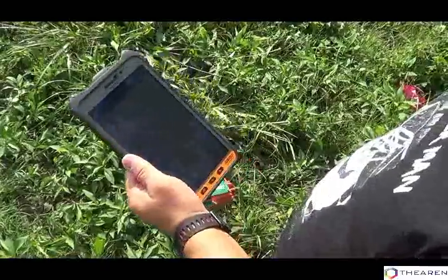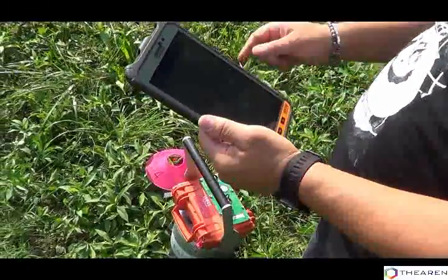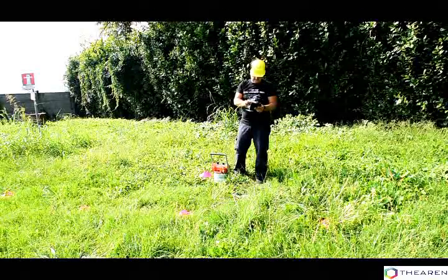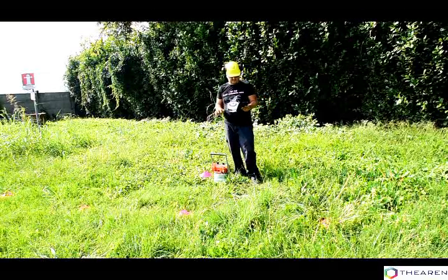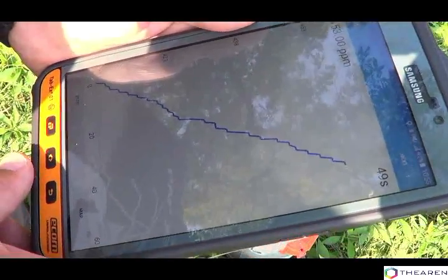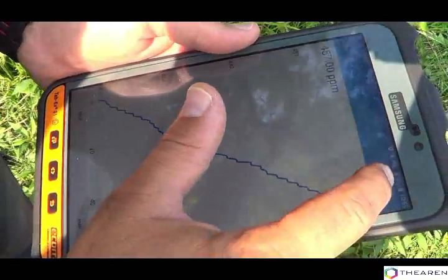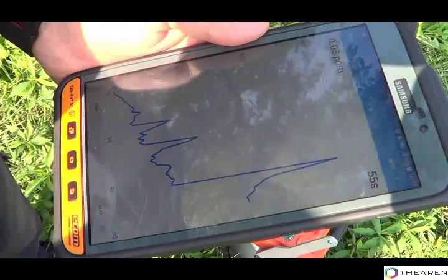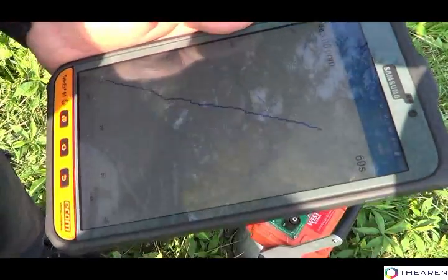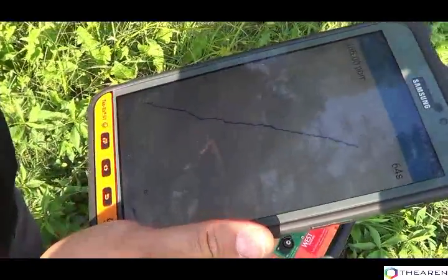A software connected by Bluetooth to the device allows to evaluate the slope of the function that describes the increase of concentration of the analyzed pollutants. The carbon dioxide and VOC concentration acquired by the instrument is displayed in real time on the device screen. In this way, it's possible to evaluate the progress of the measurement and immediately check the flow rate at the measurement point.